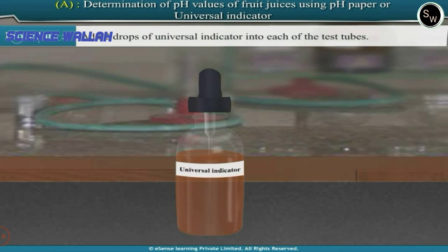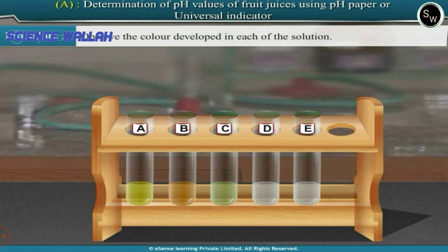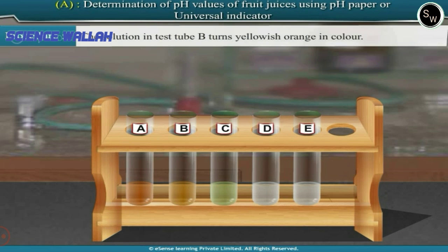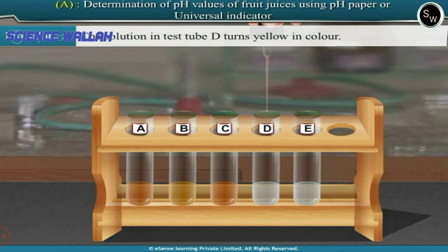Add 2 drops of universal indicator into each of the test tubes. Observe the color developed in each solution. The solution in test tube A turns orange, test tube B turns yellowish orange, test tube C turns orange, test tube D turns yellow, and test tube E turns orange in color.